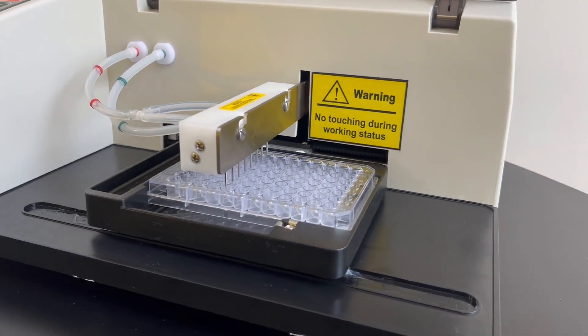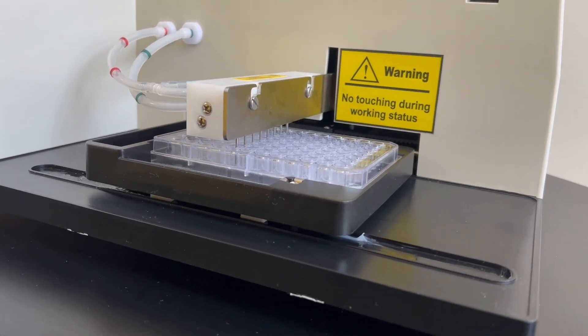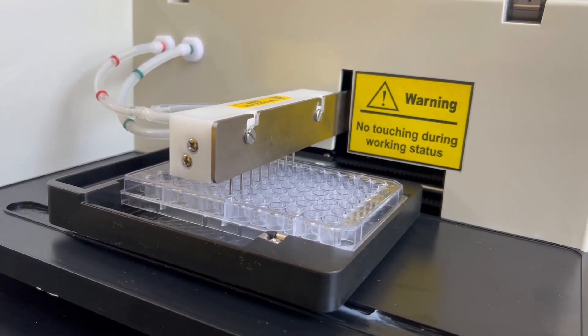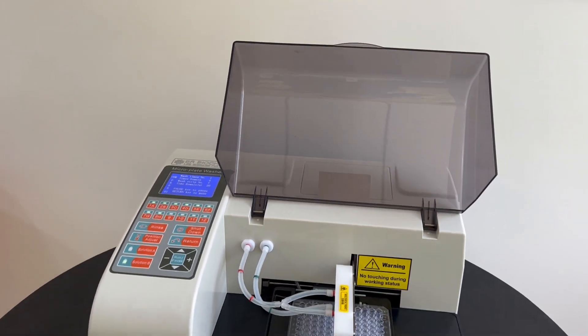Our plate washer allows you to clean any specific line or hole, eliminating the need to wash the entire plate or strip. Our convenient stop or pause key on the panel gives you the flexibility to control the process according to your requirements.